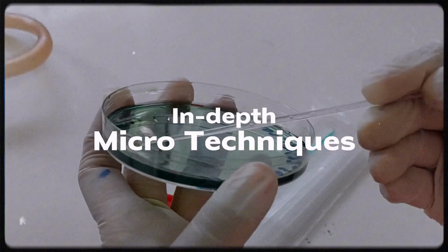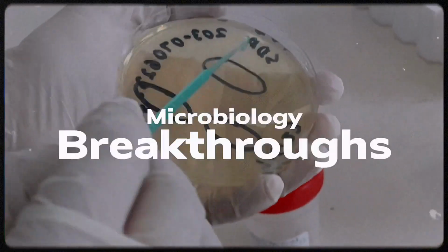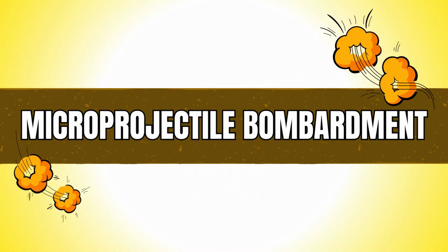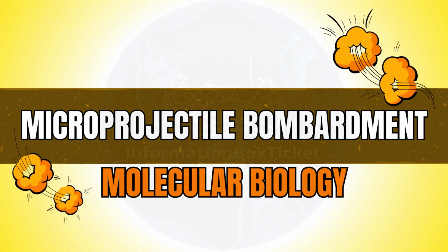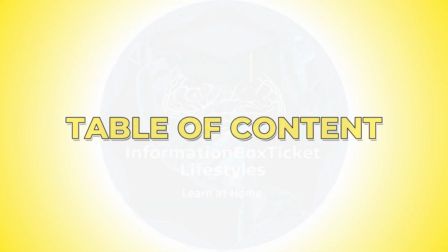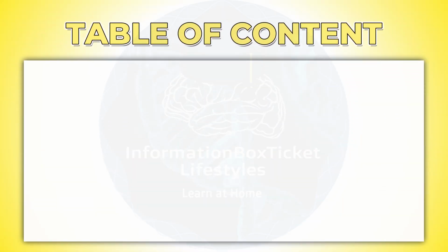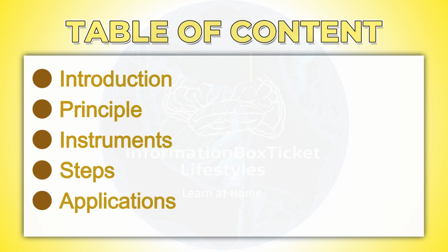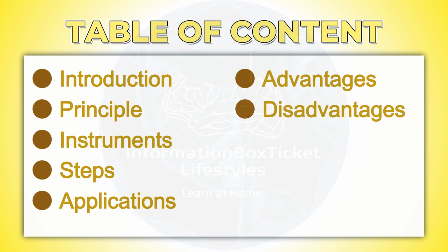Let's explore in-depth micro techniques and uncover groundbreaking insight together on this educational journey into the fascinating realms of microbes. Microprojectile Bombardment, Molecular Biology. Table of Contents. Introduction. Principle. Microprojectile bombardment instruments. Steps. Applications. Advantages. Disadvantages.